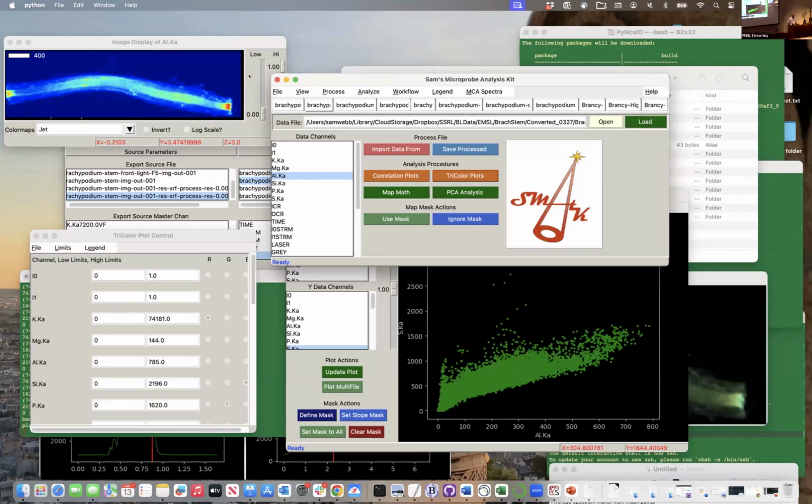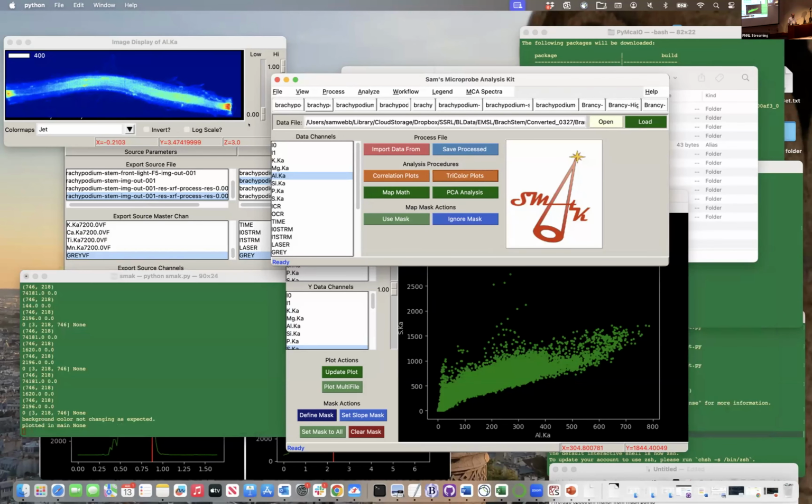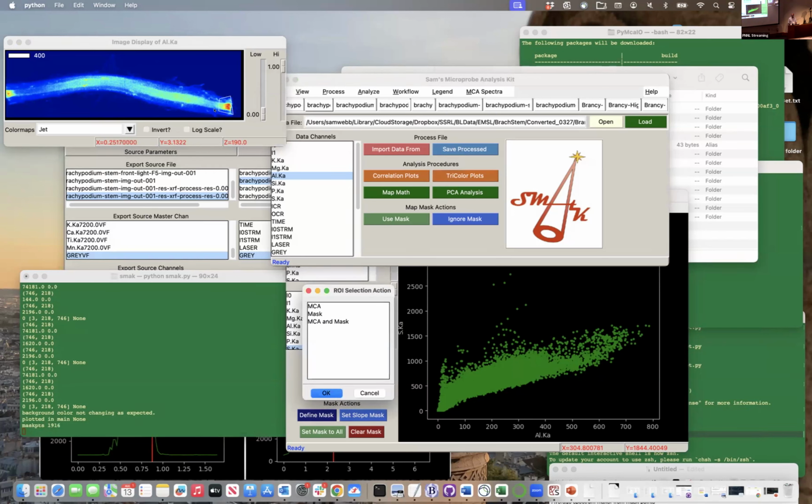But we're going to use the shift. I'm going to hold down shift. And for those of you who use the toolkit, we know we have to hold it down and leave it held down, not just release the shift key. Hold it down until you finish. And we're going to draw a region here. And when I'm done with that region, I'm going to double click and it will close the last box. You don't need to make it match perfectly. You just find the last one and double click.